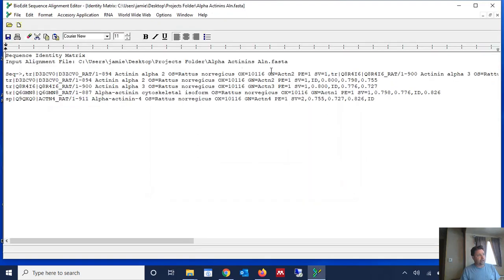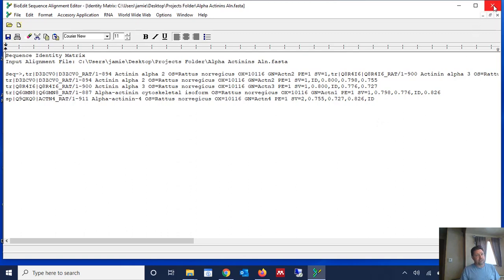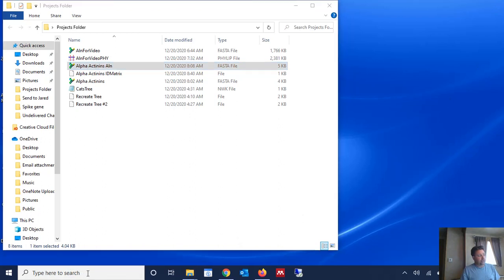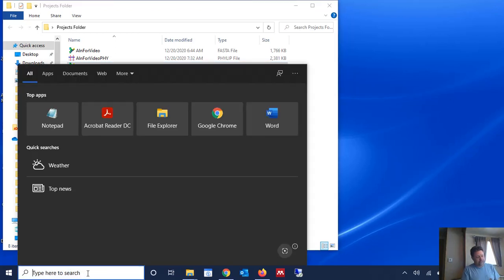Now this is going to open it up in BioEdit but it's not really that readable here in BioEdit. So we really want to open it in a program like Excel. So now that we have it saved, we can close BioEdit and then what we want to do is we want to open Excel.